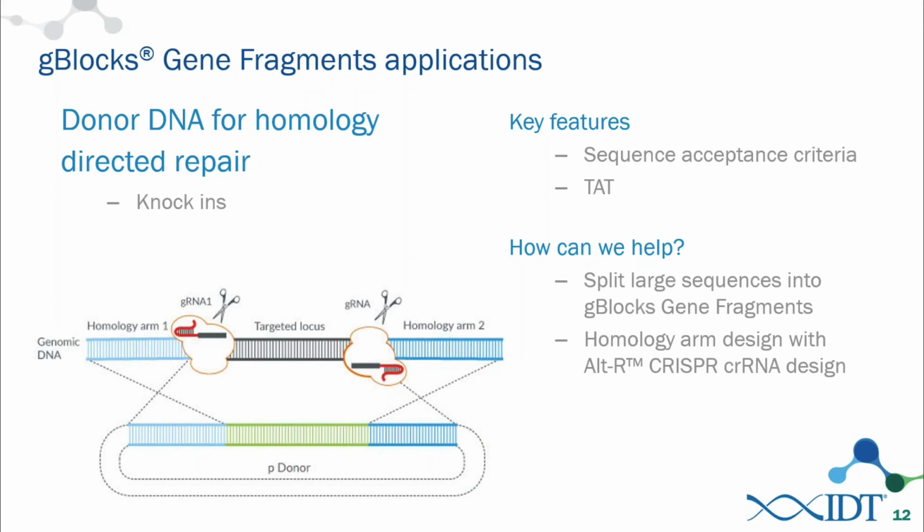But what we believe happens is even when you store them dry, there's a small amount of moisture in there that can actually act on the DNA, and you also go through the dry down process, which can increase oxidation and increase adduct products like 8-oxoguanine. So storing it in TE and storing it at -20 or -80 is probably the best option for storing those. And again, if you're at a low concentration, storing that with a carrier in there is going to help for recovery of that material when you pull it back out of the storage container.